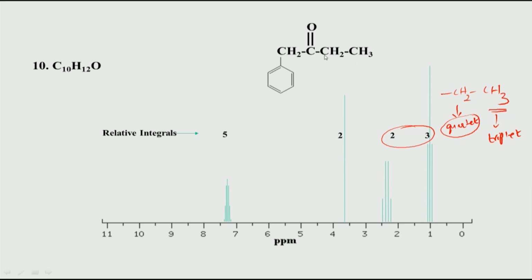On this side, this is what we saw, there is a CH2 and a CH3, and that is standard. Remember I said that whenever you see a triplet methyl and a quartet somewhere around 2 ppm, it automatically means this group is present, but this group is not attached to oxygen. That means it has to be attached to something else, but if it is attached to a carbon containing a hydrogen, then you will not expect a quartet, because that hydrogen would add to this. So, 3 plus 1, 4 plus 1, you would expect a quintet for this.